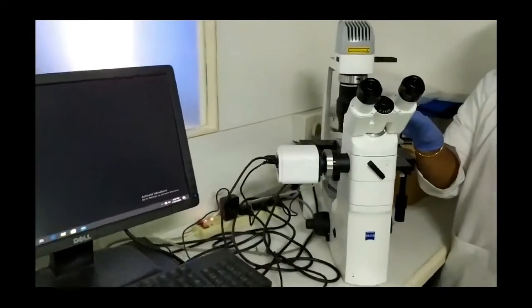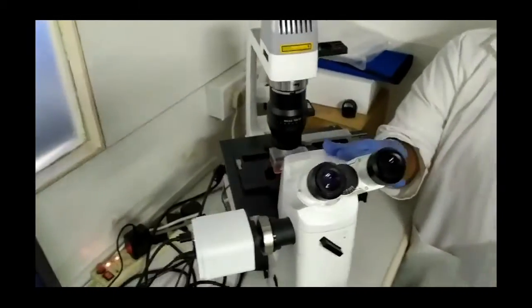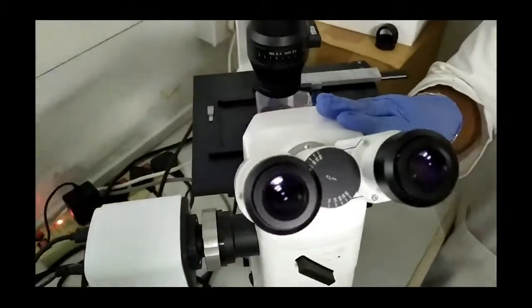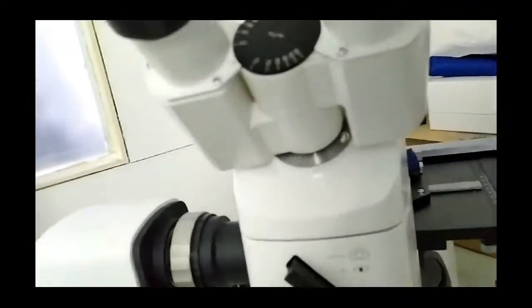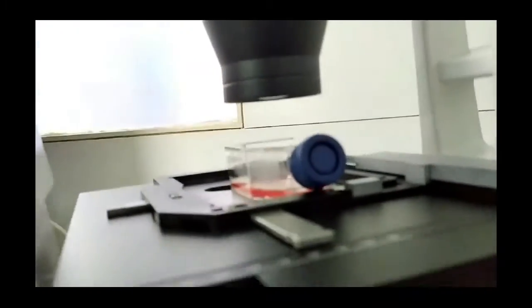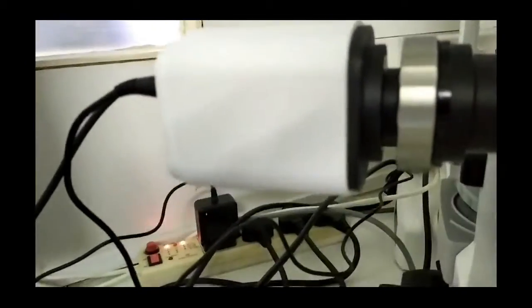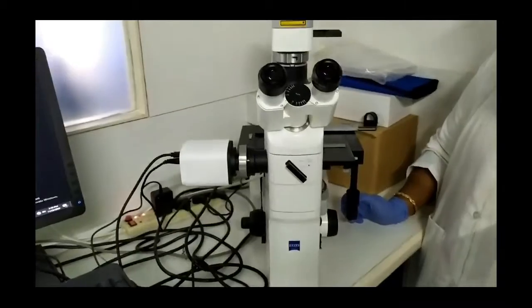This is an inverted bright field microscope with a fluorescent attachment. It is called an inverted microscope because the objectives are placed below the stage. The objectives are 4x, 10x, 20x, 45x, and 63x. Above the stage, there is an attachment for fluorescent filters. At the side of the microscope, a camera is attached so that images and live videos of the cells can be recorded directly through the camera.